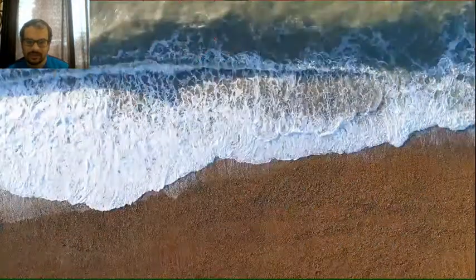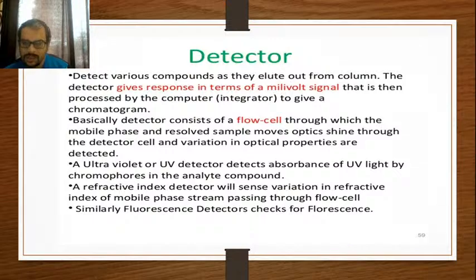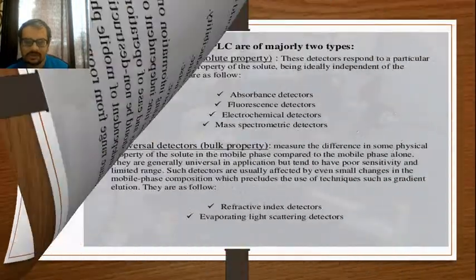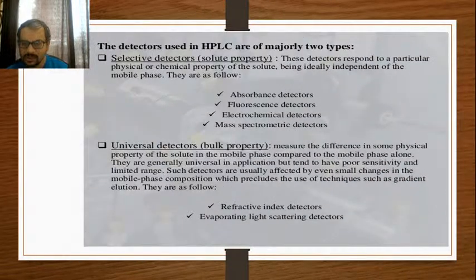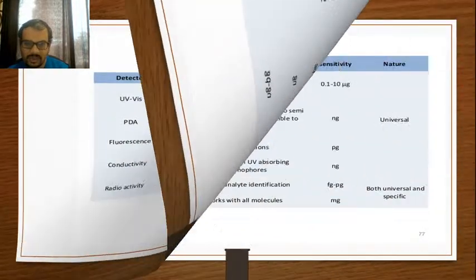As we have started with the detector system, we dealt with various aspects. We already covered the instrumentation part. What are detectors? Ideal properties of detectors, we already discussed it. Selective properties and universal detectors. Then the list of detector system overview, we dealt with it.